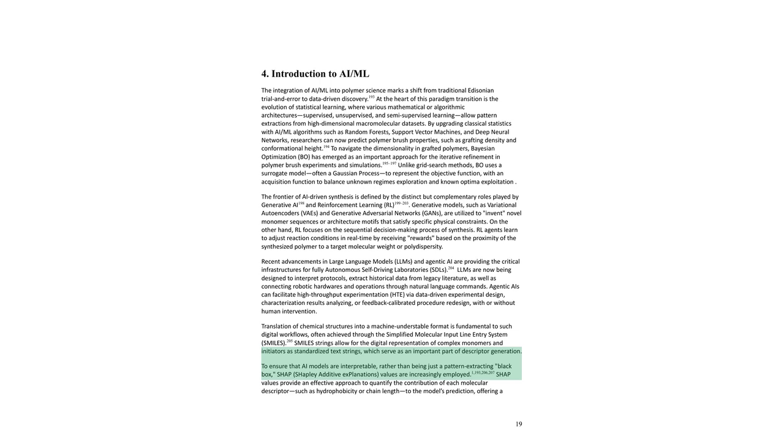SHAP, which stands for Shapley Additive Explanations, allows researchers to understand why a model made a certain prediction by quantifying the contribution of each input feature, like chain length or hydrophobicity, to the final result. So, how is this AI/ML toolkit being applied specifically to polymer brushes?